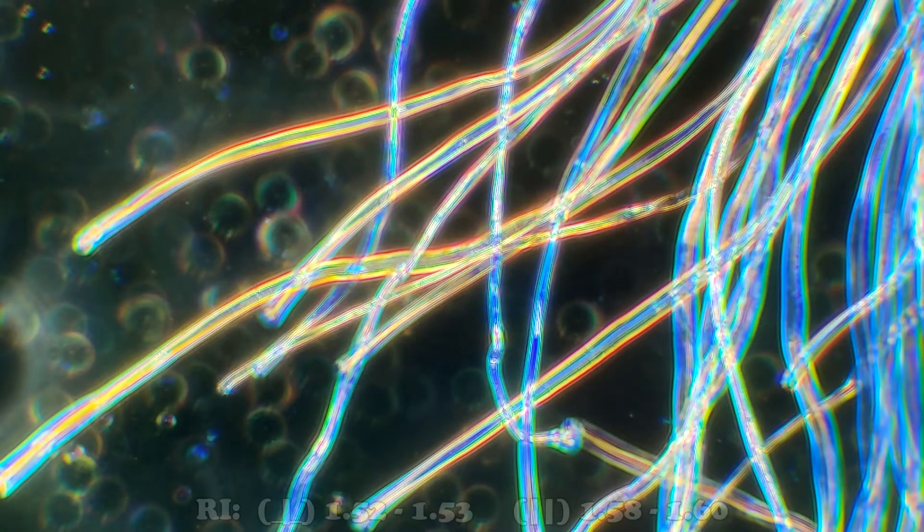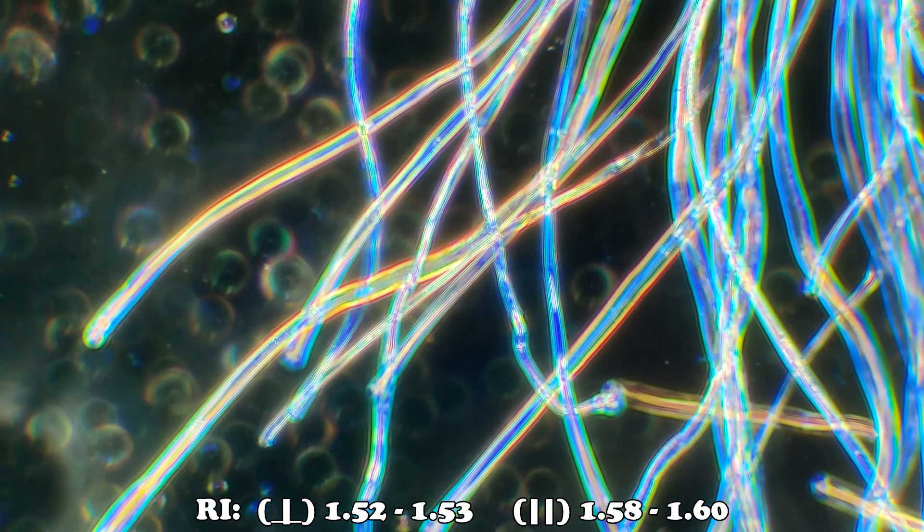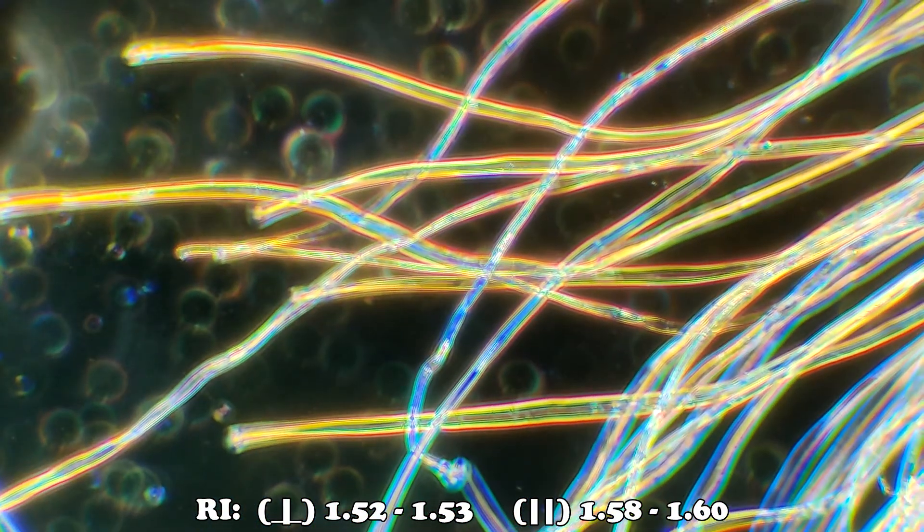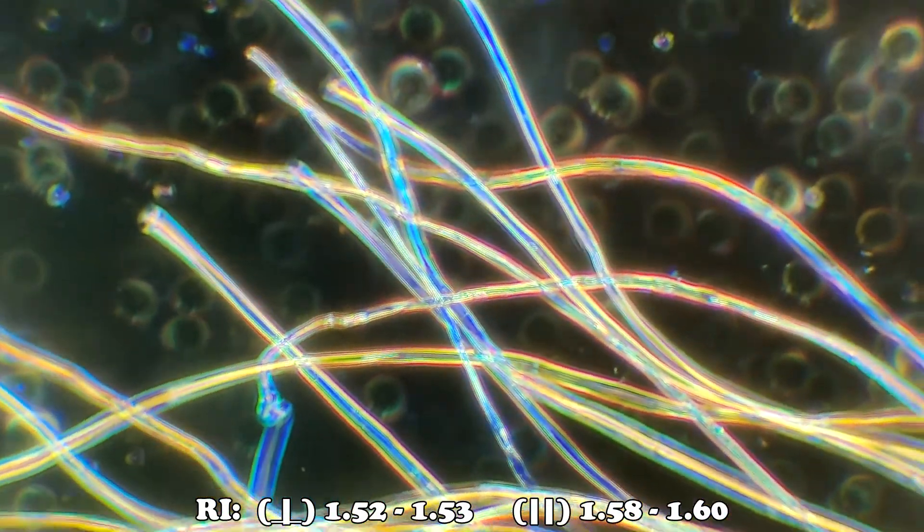When immersed in 1-5-5 refractive index liquid and observed with central stop dispersion staining, the fibers will exhibit blue and yellow dispersion colors.